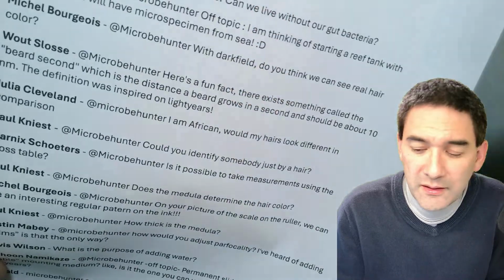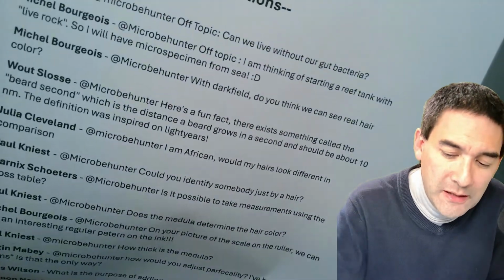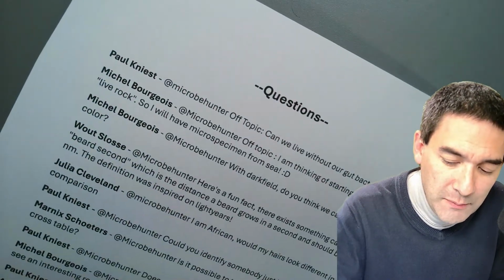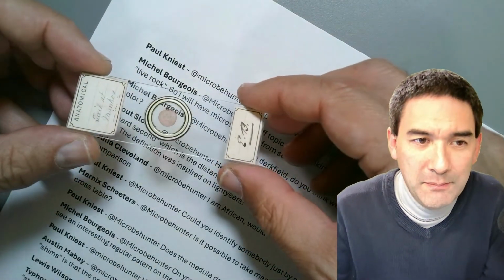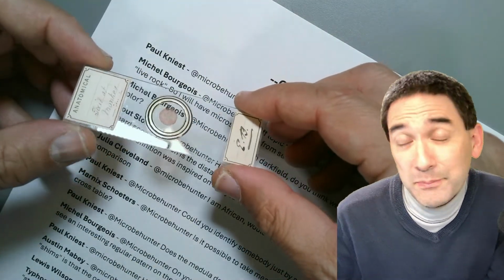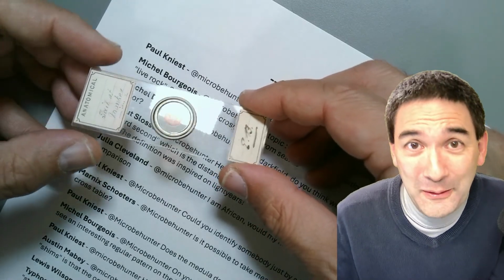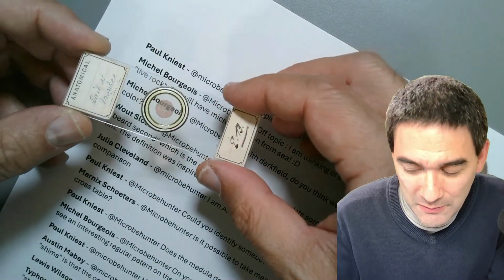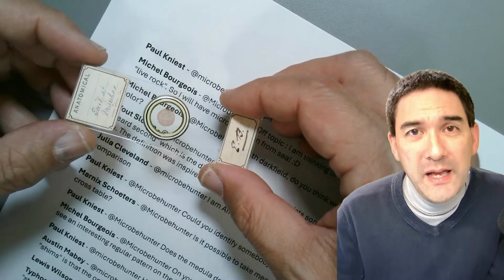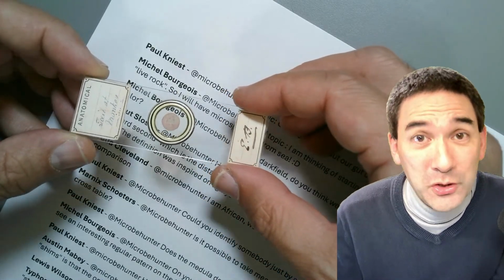I know that those traditional microscope slides from the last century used a mounting medium very frequently called Canada balsam, and this has stood the test of time. It's over 100 years and it looks like new, right? So I do not know whether PVA glue will also last 100 years plus.